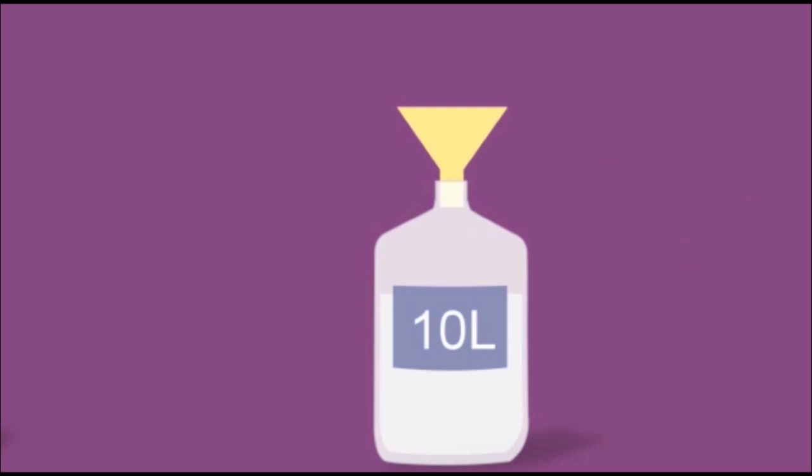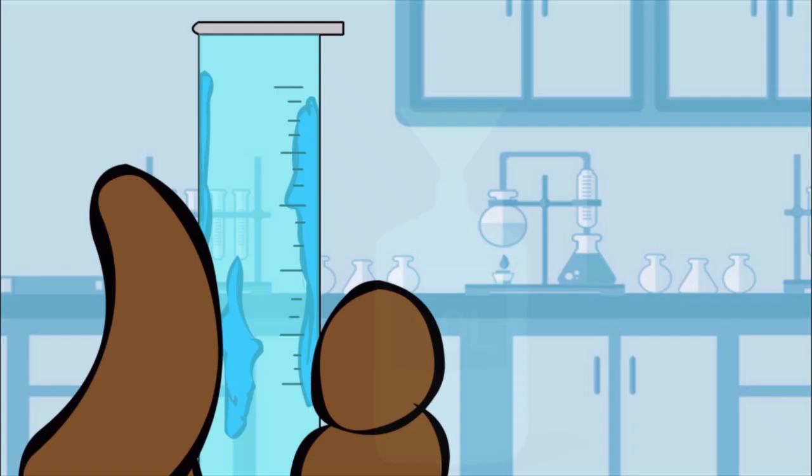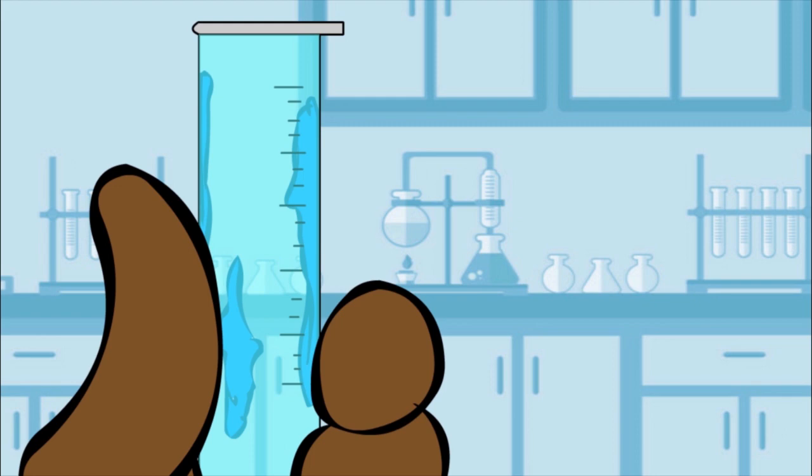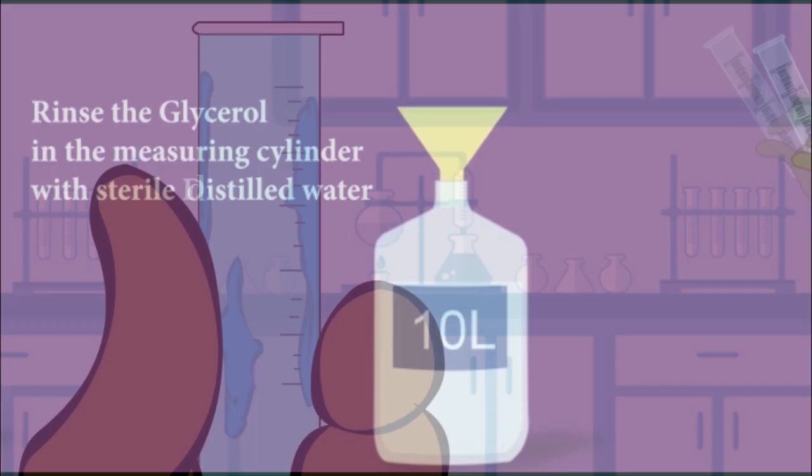Pour in the hydrogen peroxide from the measuring cylinder. Add the glycerol from the measuring cylinder. Remember glycerol is very viscous and sticks to the walls of the measuring cylinder. It should therefore be rinsed with some sterile distilled or cold boiled water and then emptied into the large container.